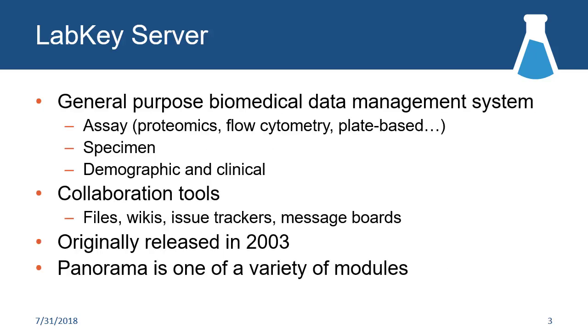So, a real brief LabKey Server overview. This is a system that's, like I said, about 15 years old. It came out of more of a protein database search style of mass spec proteomics, and then we've expanded it to support a bunch of other types of assays, plate-based assays, flow cytometry, sequencing, etc., as well as a lot of metadata tracking.